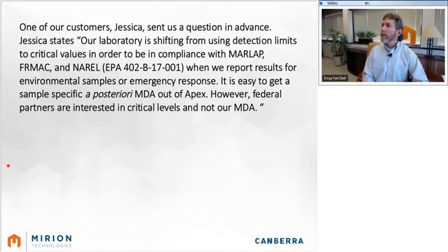The next question is, what about drifting spectrum and calibration? That's a tougher question. If you have a reason to have your spectrum drifting, especially on a high purity germanium detector where it should not be drifting, then you have a little bit of an instrumentation problem. You could certainly correct for that by doing an energy calibration immediately before you do a sample analysis and then doing another calibration check immediately after a sample analysis to make sure it was stable during that period. But in general, that suggests an instrumentation problem.